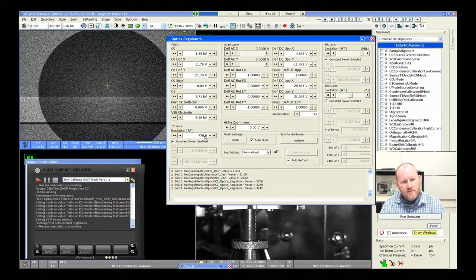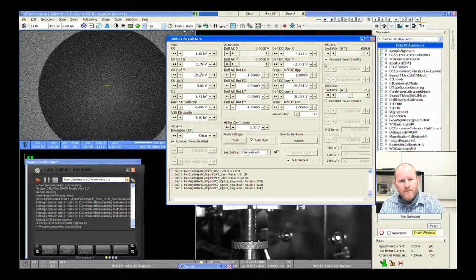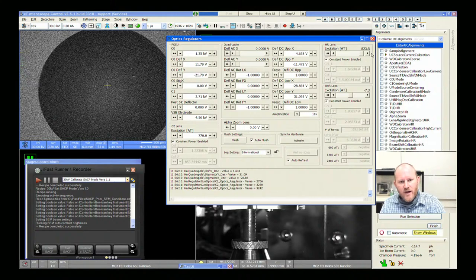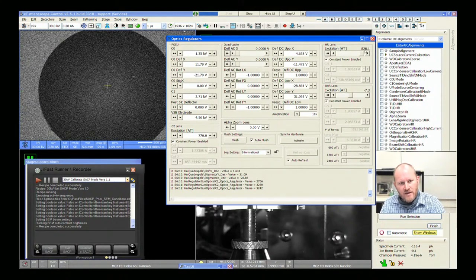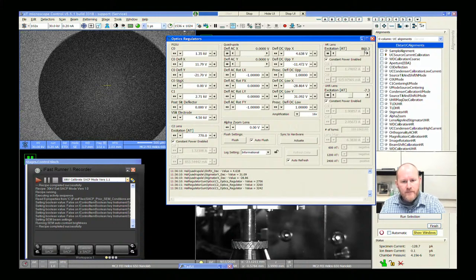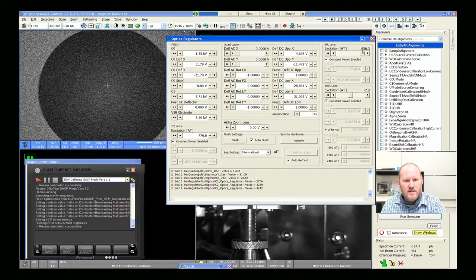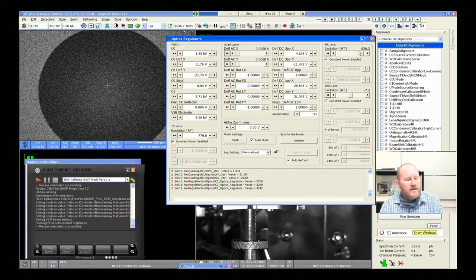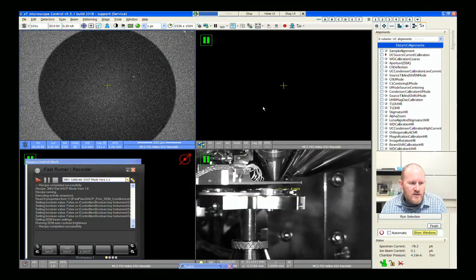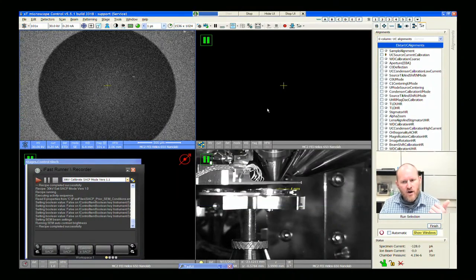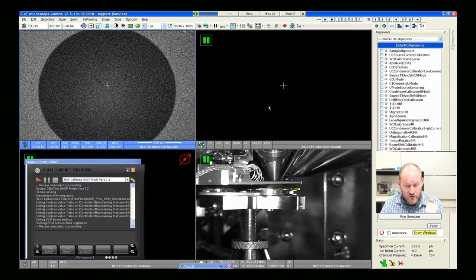Now you see the lookup table reverted — we're back at 770. I'm turning now the focus knob on the MUI and you see this excitation of the HR lens changing. So that just shows this is the HR excitation. The first thing we need to do is turn C2 off, focus with C1, and retract that aperture.